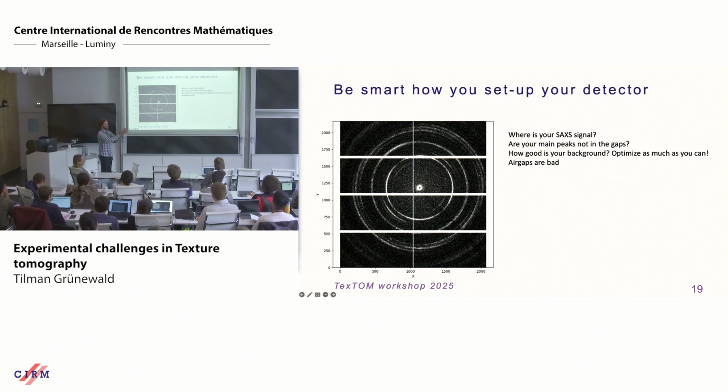As much as I love your multilayer Laue lenses, in my mind, they give you way too much working distance. I'm not kidding, it's really about getting the background down. Every air-scattering photon that you have in your detector image decreases your signal to noise. You don't need that. Try to get everything as close together as possible. Not too close, but too close for comfort.